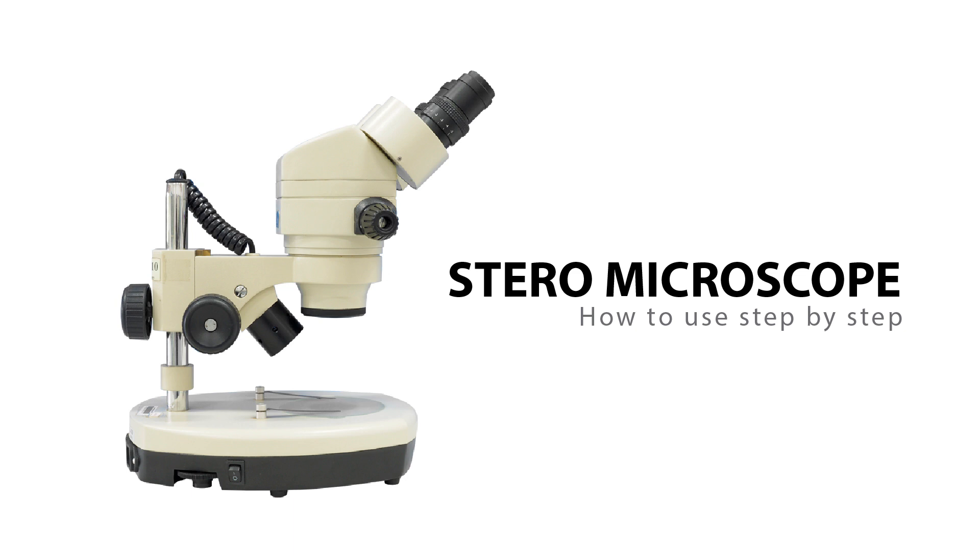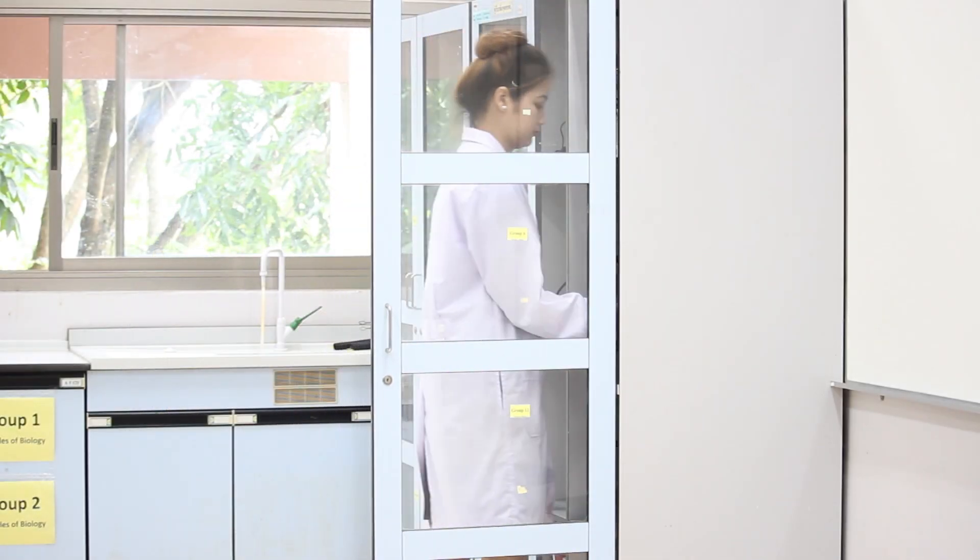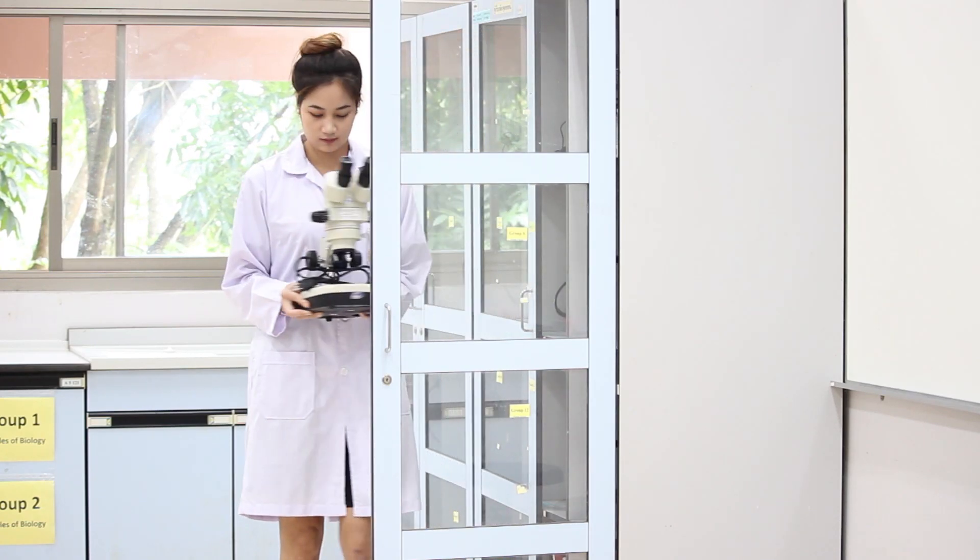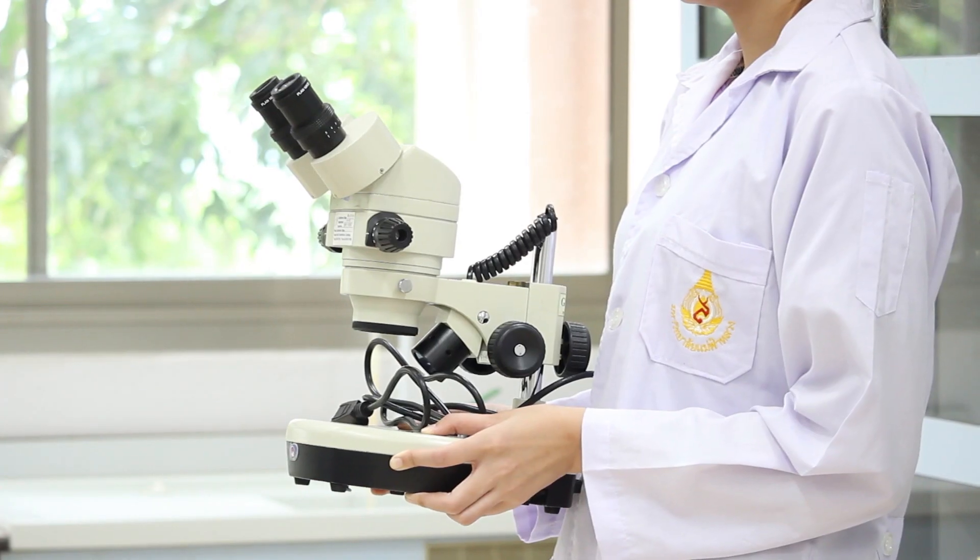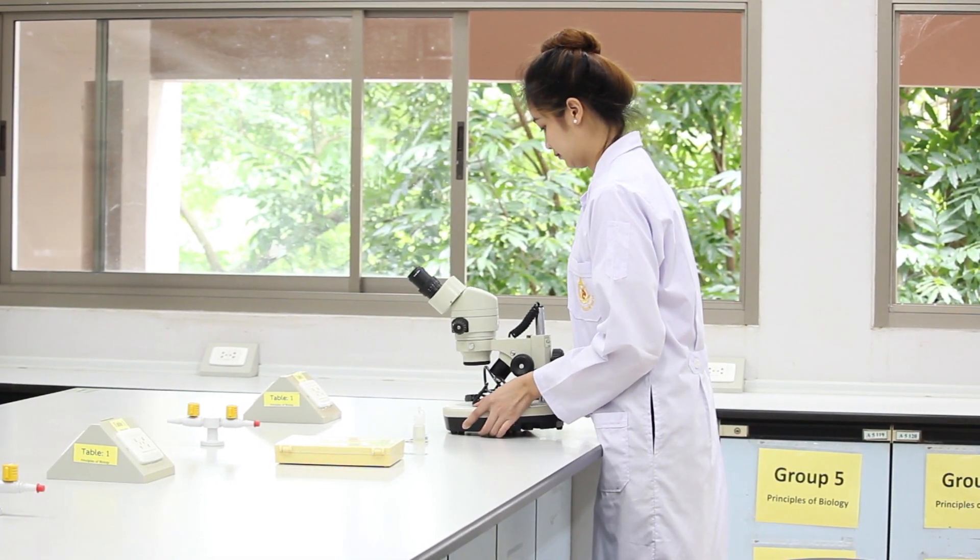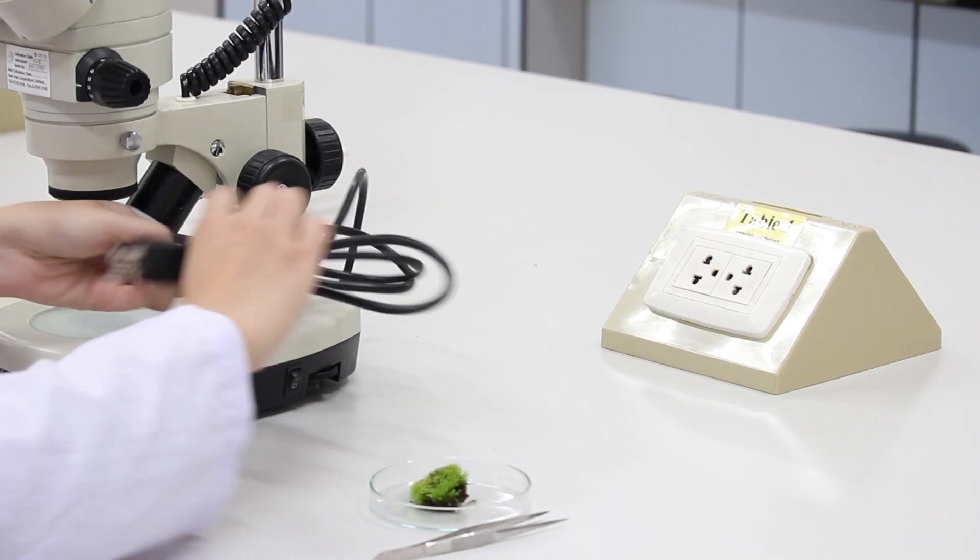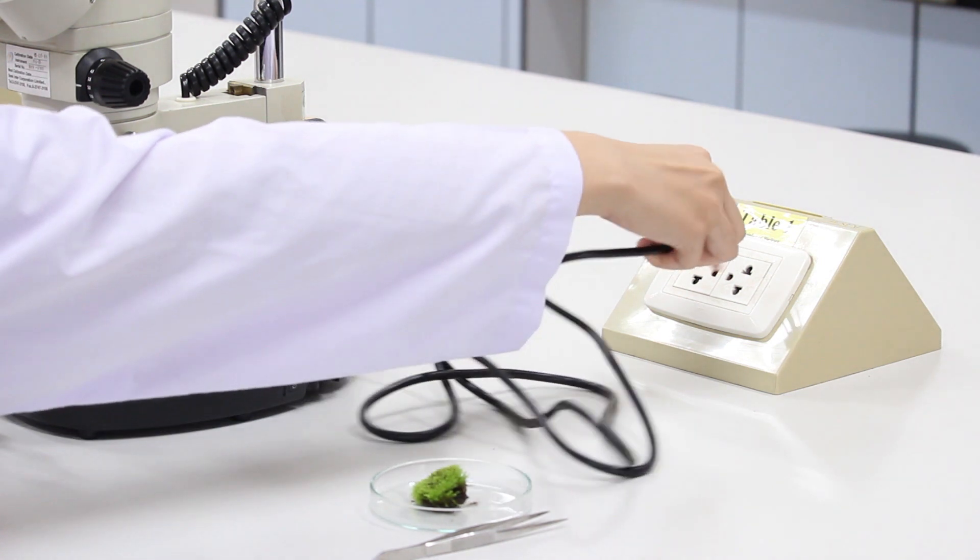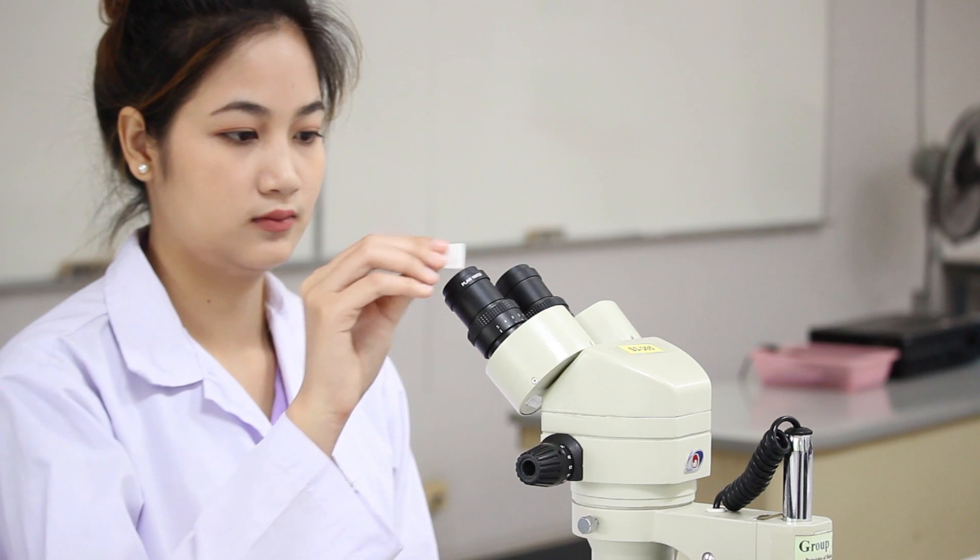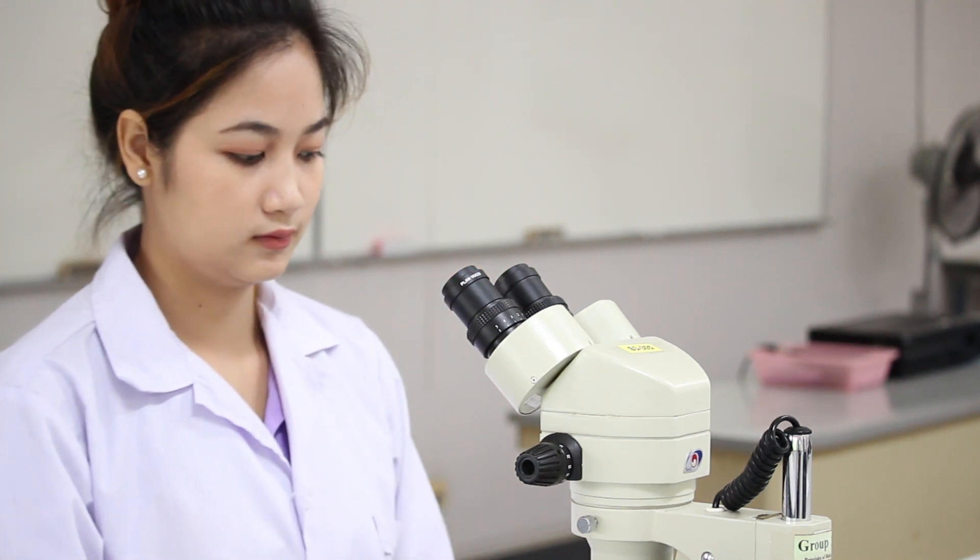Let's start how to use a stereo microscope. First, carefully take the microscope from the cabinet by using both hands to hold the base of the microscope. Then, put the microscope on the bench. Next, plug the power cord of the microscope into the power socket on the bench. And then, clean the objective lens and the eyepieces by using the lens paper.